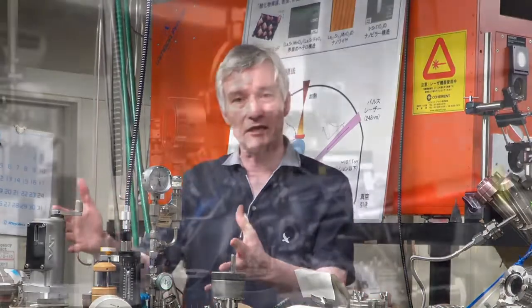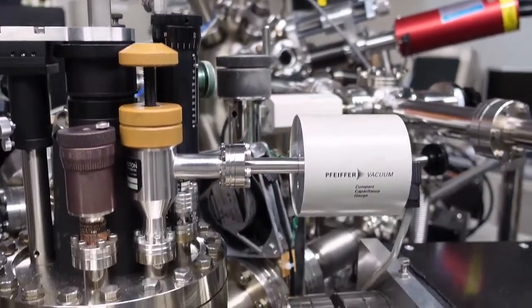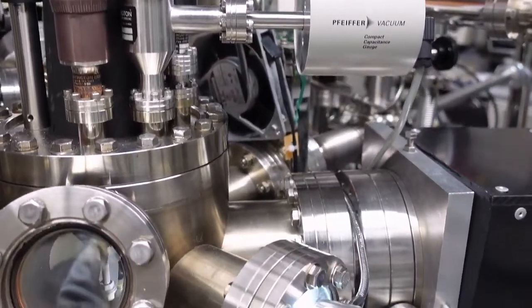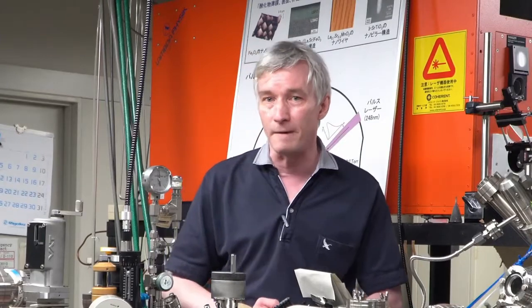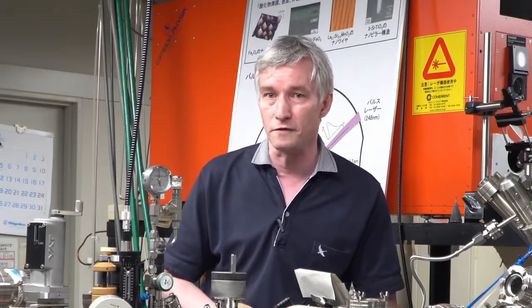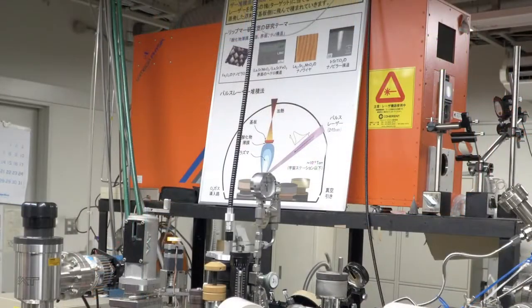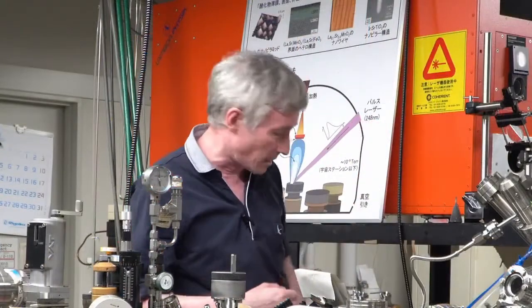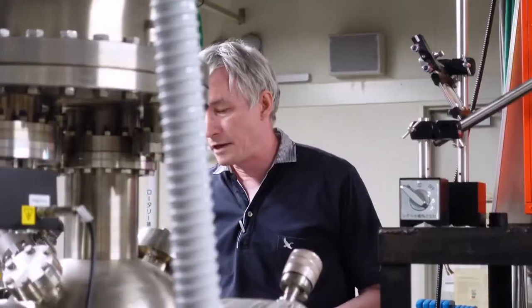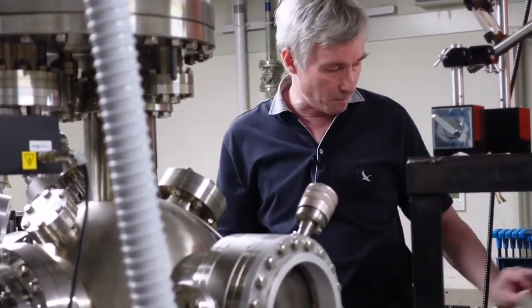In front of me, you can see a vacuum system, which is called a pulsed laser deposition system, which we use to grow nanoscale oxide thin films. Now, oxides are well known to be very stable materials that are difficult to evaporate and difficult to grow in thin film form. We therefore use this powerful pulsed laser behind me, and if I start this laser, you will hear kind of a clicking sound when the laser is firing. And you can see bluish light coming from the laser on this white paper.